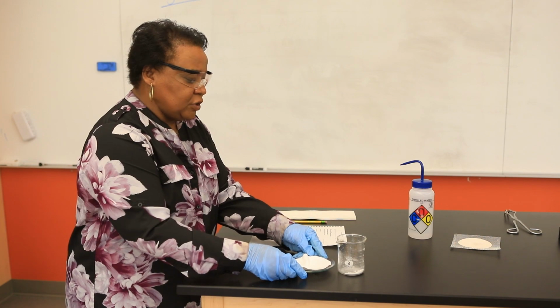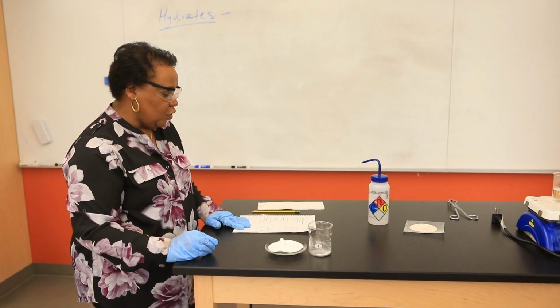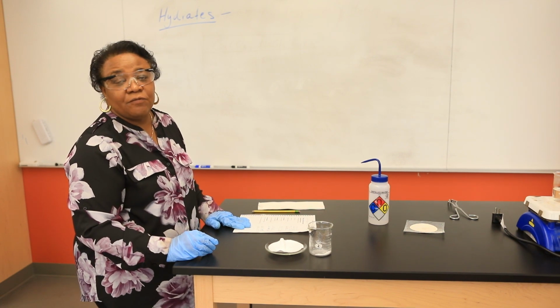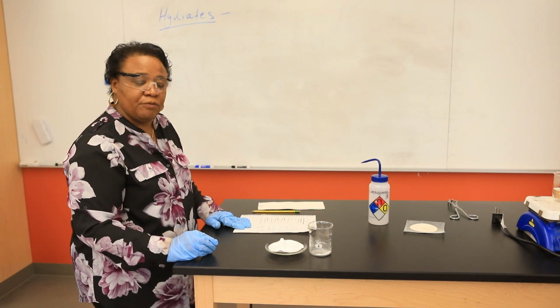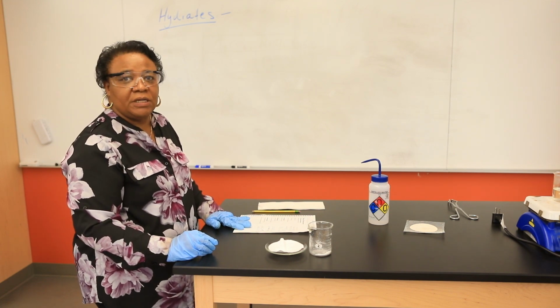Alrighty, so I'm assuming now that you've recognized that we've isolated all 3 components using several physical means of separation. But in addition to that, we did use 2 chemical means of separation.